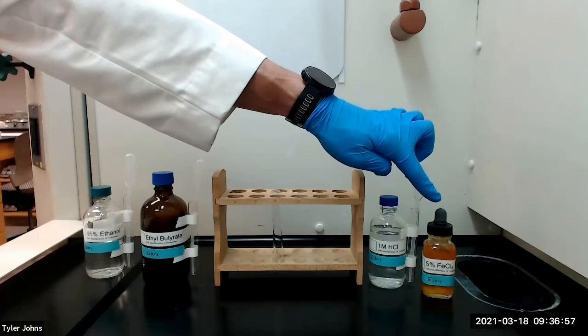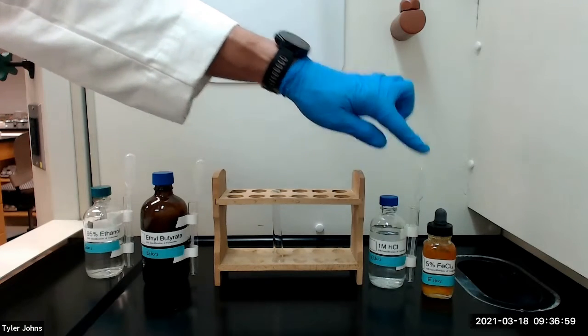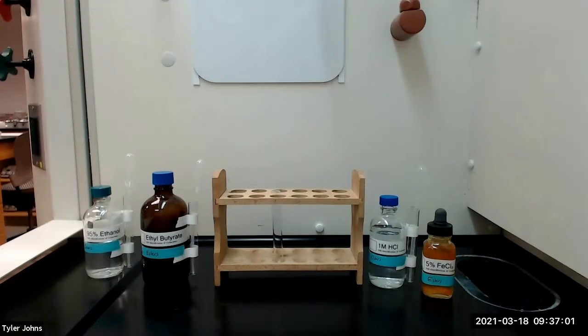We will then add one to two drops of 5% ferric chloride solution. The appearance of a burgundy, magenta, or reddish brown color indicates a positive ferric chloride test.